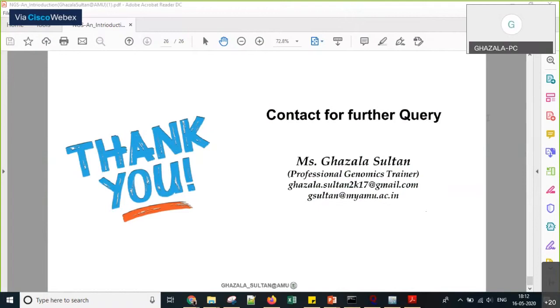I have another question. How to generate paired end reads and use of it? Okay, single end reads and paired end reads are generated by the sequencer itself. There we have different types of sequencers, and we need to opt for whether we want paired end sequences or single end sequences. That depends on the sequencer we are using. Thank you, ma'am. I have another very basic question regarding NGS sequencing. Yes, please go ahead.